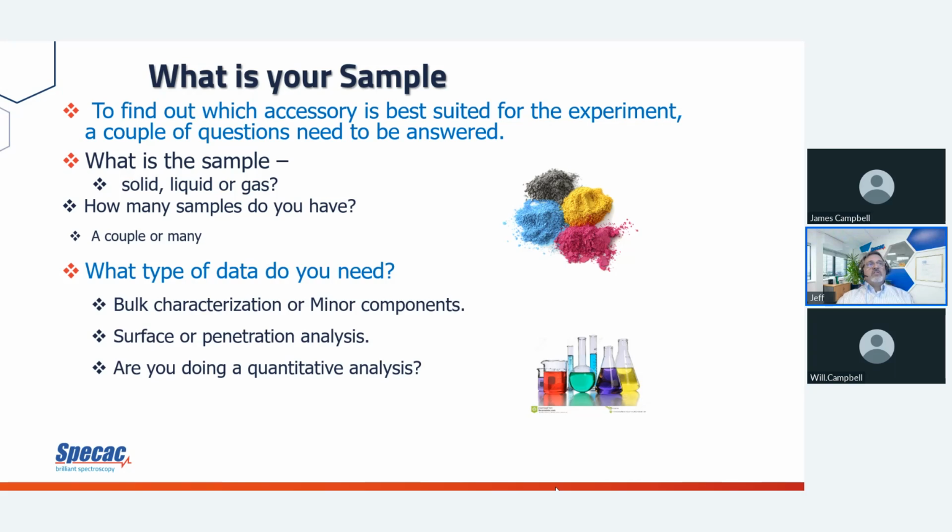Then the next question is, what type of data do you need? Do you just need that bulk characterization, what is this? Or do you need the minor components in there, like an additive in an oil? Or just the surface analysis: I just need to get that top coating, I just need to know what that spot is. Or do we need the bulk, the penetration? You need to get into the sample to really find out what it is. And then you can always do quantitative analysis.